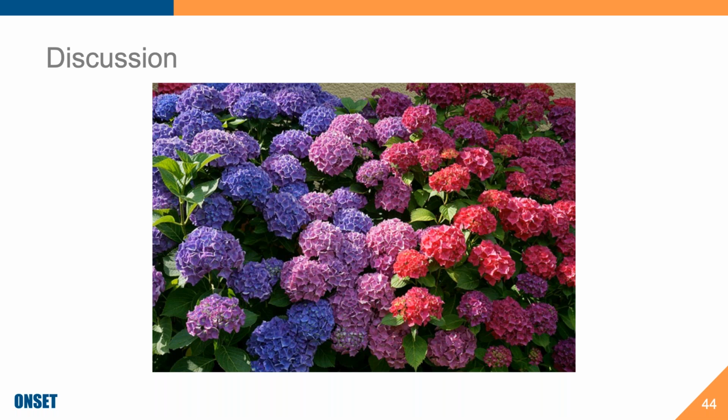The manual recommends calibrating every 7 days, but it sounds like it could be longer between calibrating depending on conditions, correct? Yes, Sean, this is true. We recommend 7 days just out of best practices in general. If you're in a laboratory, oftentimes they will be calibrating it 2 to 3 times a day or at the beginning and end of every shift.